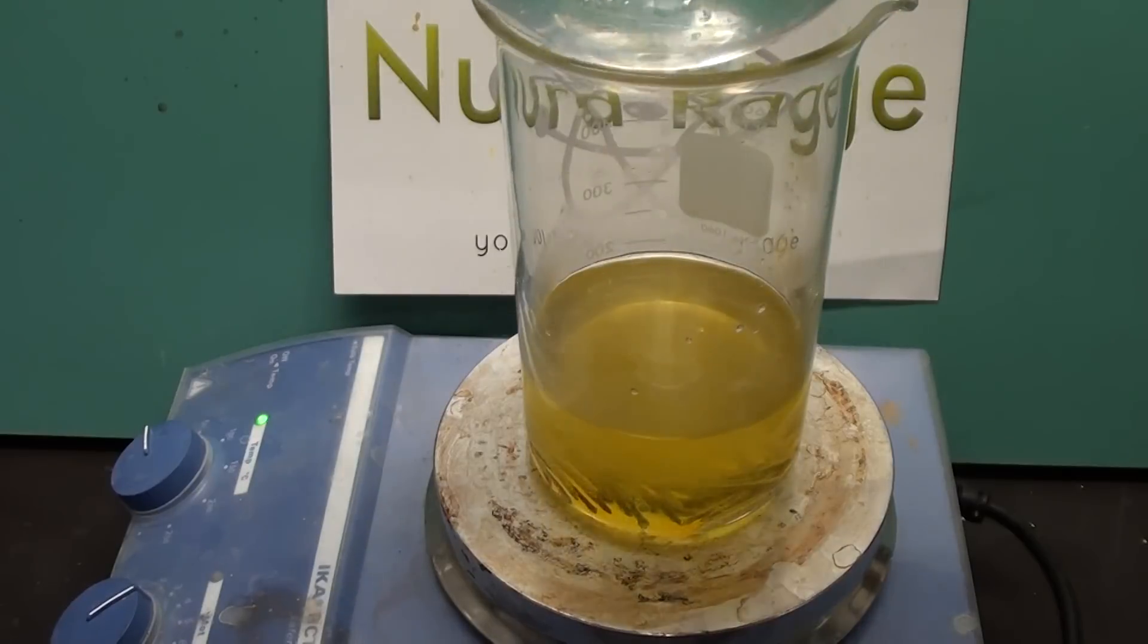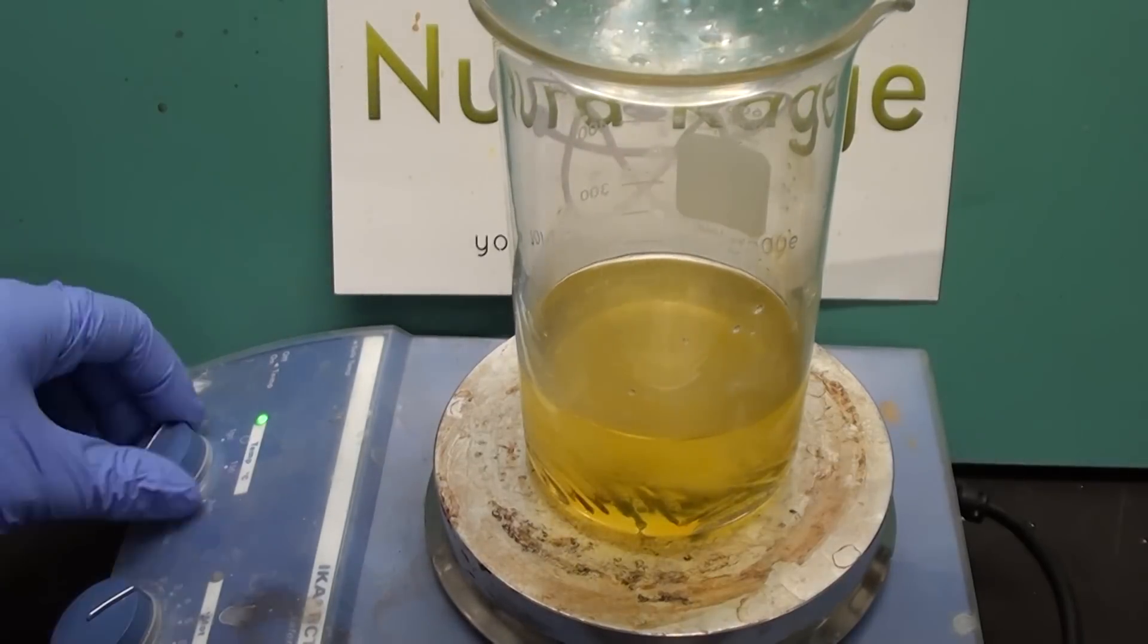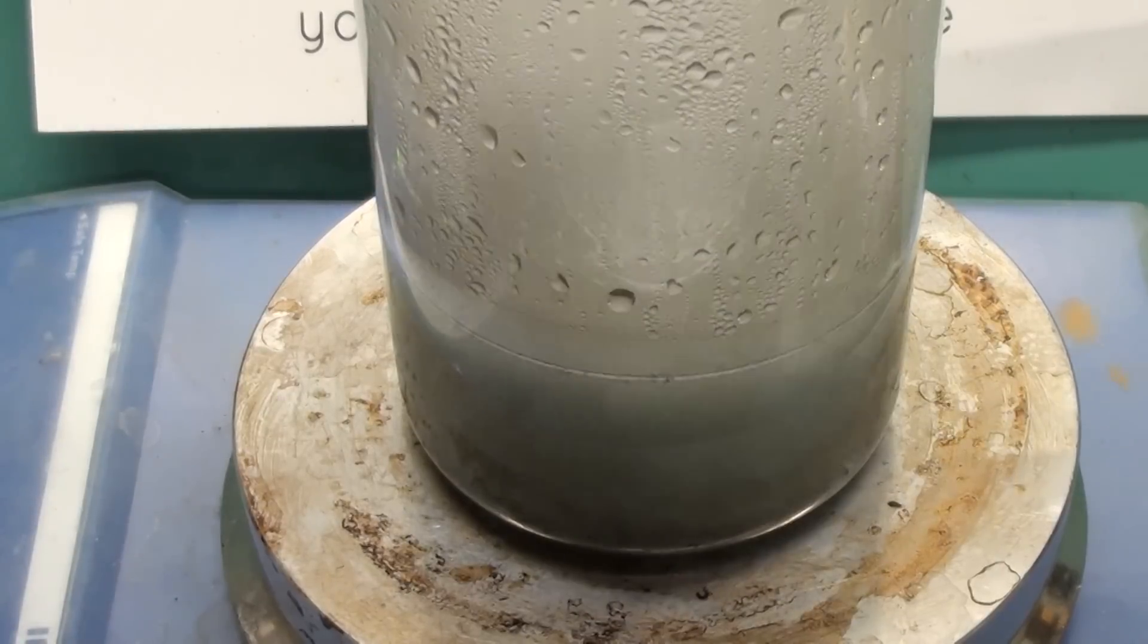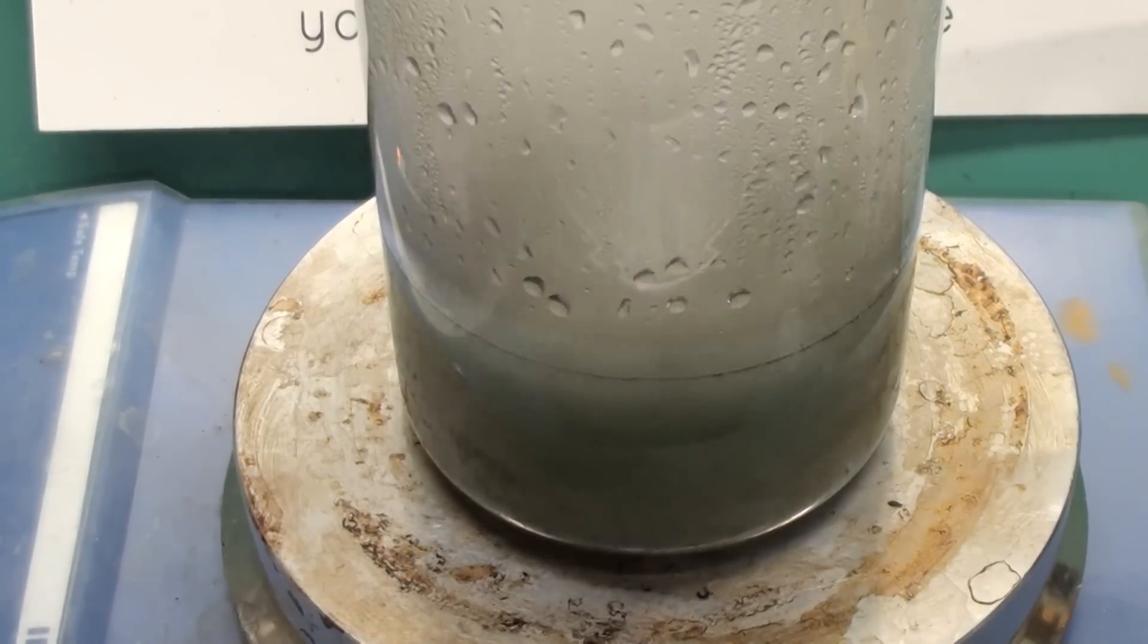I'm going to put this round bottom flask of cold water on top to recondense any vapors. And there it goes. Obviously if you're going to boil acid, do this outside or in a fume hood.